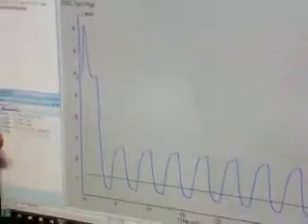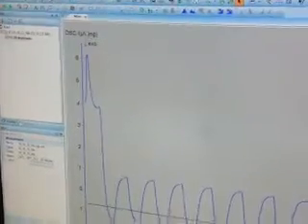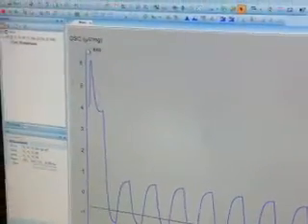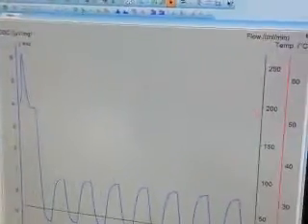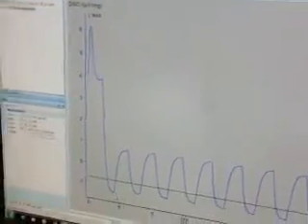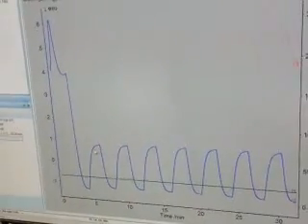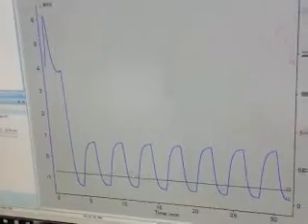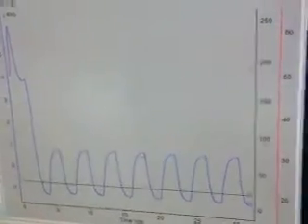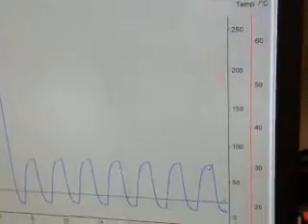The blue one corresponds to this axis over here, which is the change in microvolts, or energy necessary to cause this change in temperature to occur. Alright? And what we're looking for is we're going to take the slope of each one of these little heating curves, and we're seeing if that slope changes over time and if that change is consistent with the growth of bacteria.